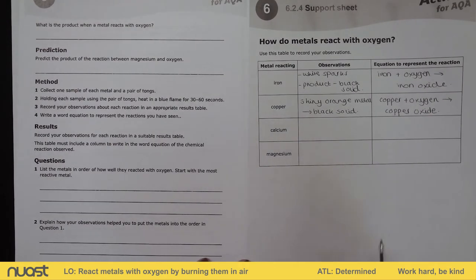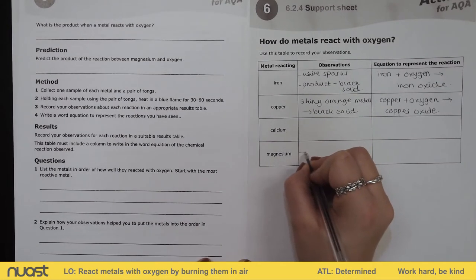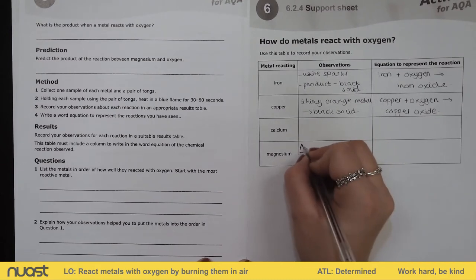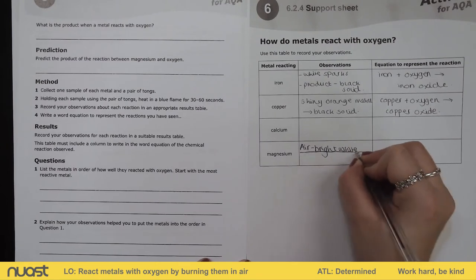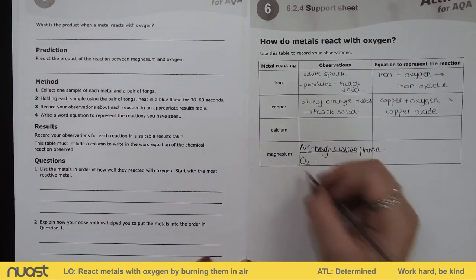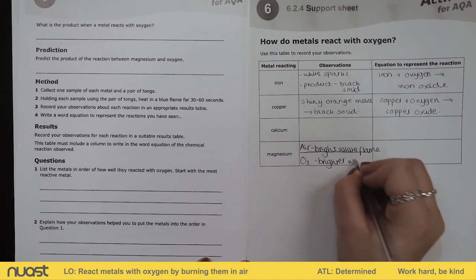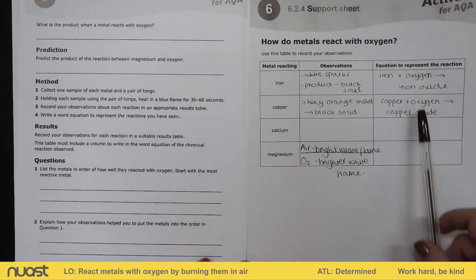So we're down here now looking at magnesium. So our observations, what we saw, we'll split this row in half. So we've got the one that was in air, we saw a bright white flame. And then the one that was in the oxygen that had a high concentration, that oxygen cylinder, it was a brighter white flame.